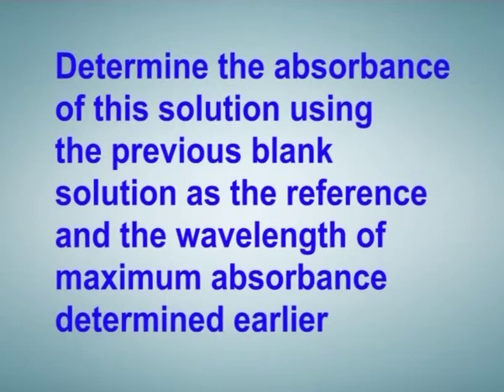Determine the absorbance of this solution using the previous blank solution as the reference and the wavelength of maximum absorbance determined earlier. Measure the absorbance at least 3 times, empty the cuvette and refill it with another portion of solution, and again determine the absorbance.